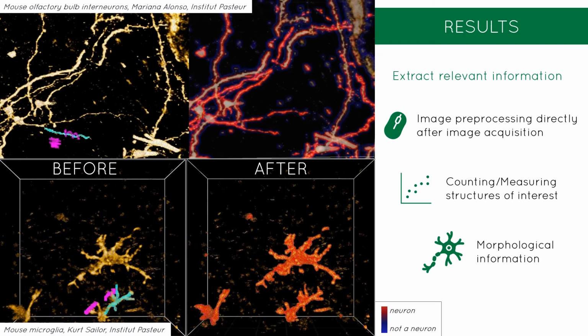From these results, we can extract some relevant information. First, it can be used as a direct image preprocessing after acquisition. We can use it as well to count or measure structures of interest, or to extract some morphological information.